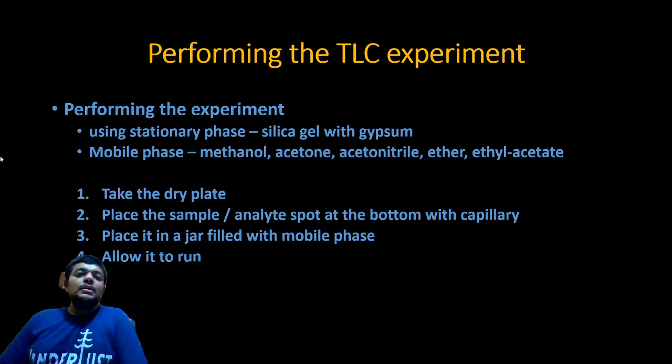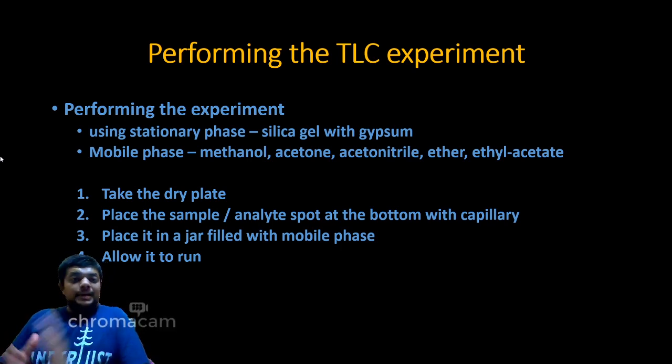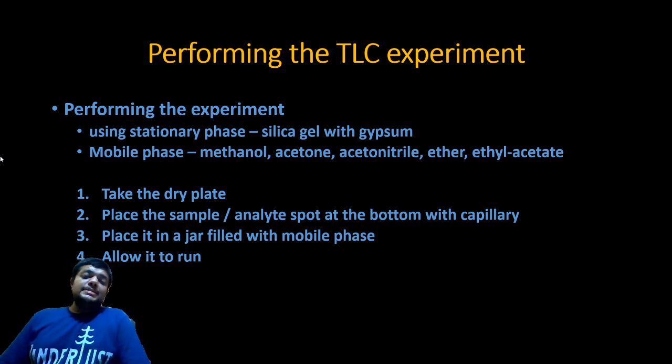Yes, we have done it. Mobile phase like methanol, acetone, acetonitrile, ether, ethyl acetate. Yes, you can take. Take a dry plate. Place the sample or analyte spot at the bottom with a capillary. Place it in a jar filled with mobile phase and allow it to run.